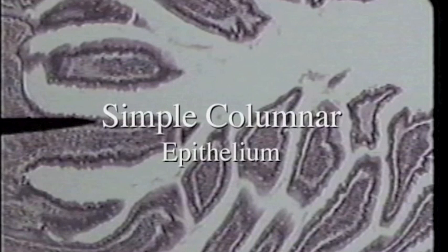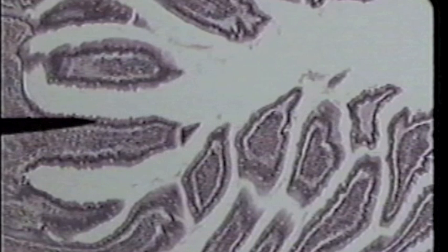This slide is the small intestine at low power. The tip of the pointer is on the epithelium lining the small intestine. We are looking at one layer of columnar cells, or simple columnar epithelium. It's not easy to tell that that simple columnar epithelium on low power, so the next slide will be at high power.